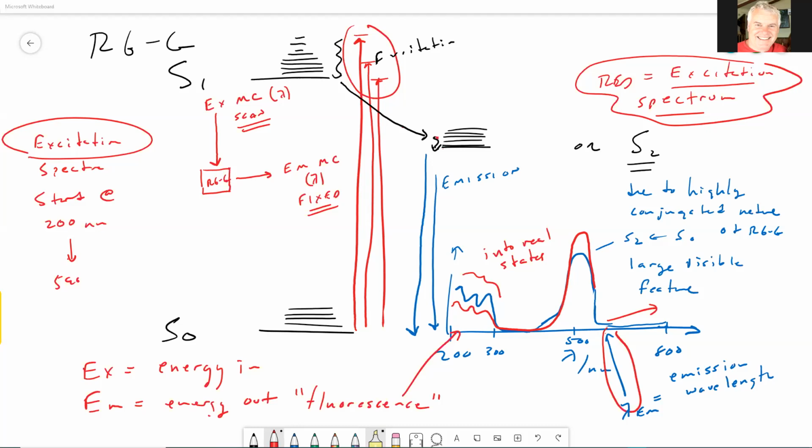Okay, good. So William says longer. Who else can weigh in on that? It says longer, longer question mark. So monitor, by monitor, I mean, do we measure the light coming out? We put light in, and then do we measure light coming out at a longer or a shorter wavelength?